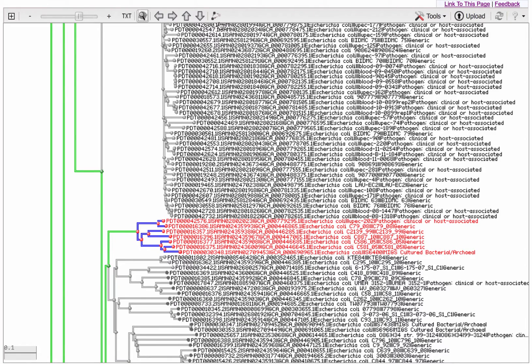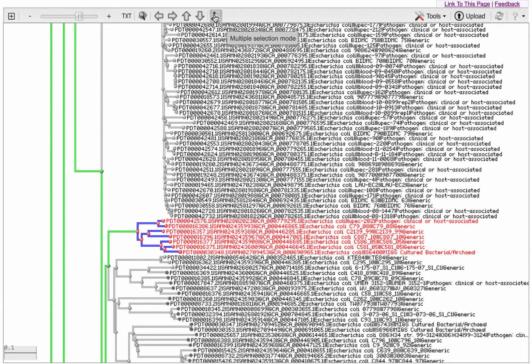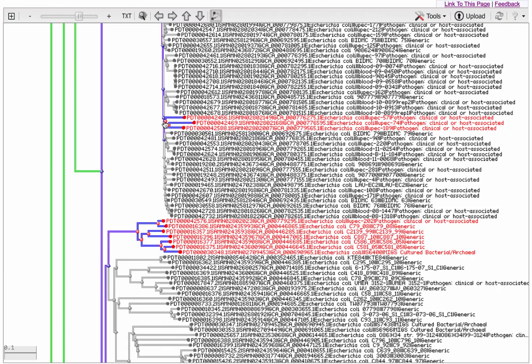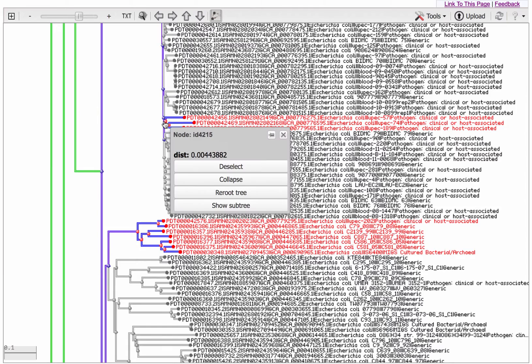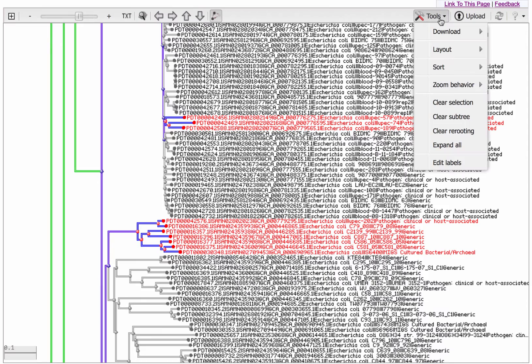And you can highlight multiple branches by first clicking on this icon for multiple selection mode. You can easily deselect multiple nodes using the Tools menu.